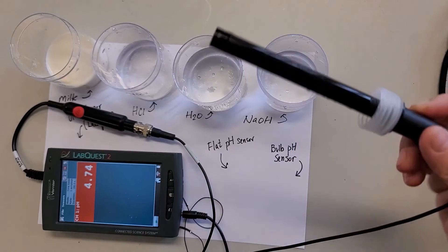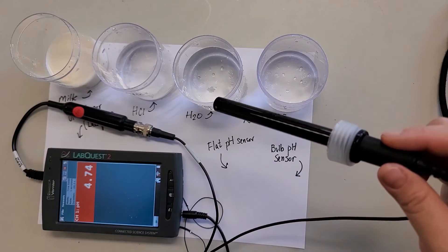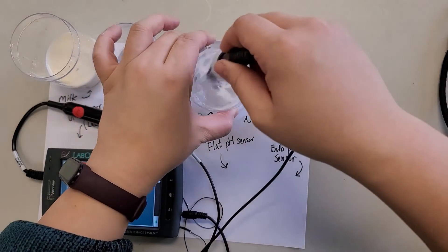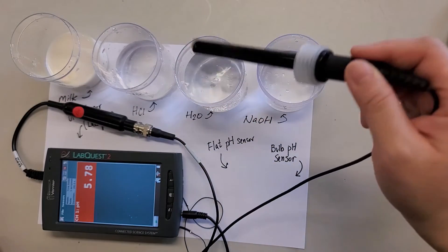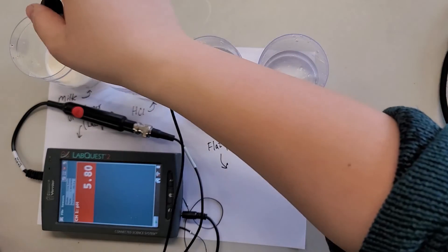Usually what I will do is I will rinse it beforehand to remove all the buffer. This is water, just rinse a bit, just briefly rinse. And then I pop it into the milk solution.